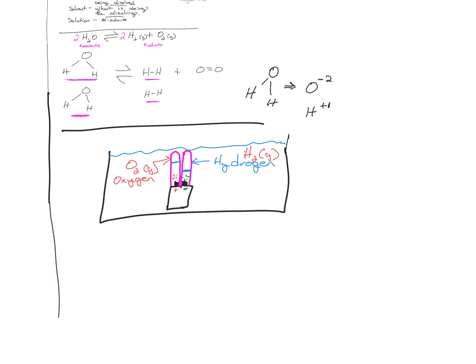You have to capture this, so you have to make sure the test tubes are filled with water. So, look out, girls, so that everyone behind you can see. You have to have this filled with water, so make sure it's all empty of air. Then turn it upside down. Once you have it like this, don't let it touch the surface again. You can lay it over the nib, right? The little nib here. Is that understood? Do it again. And one of them is positive and the other is negative.